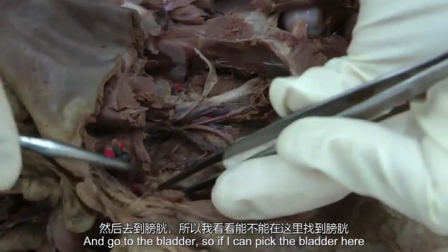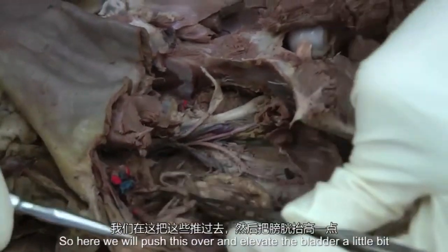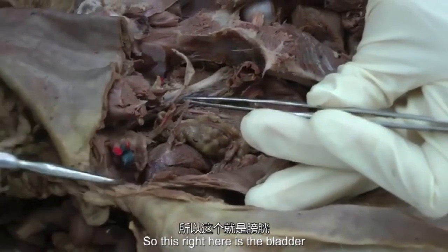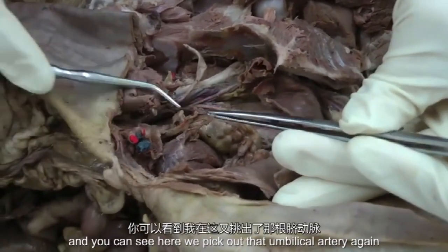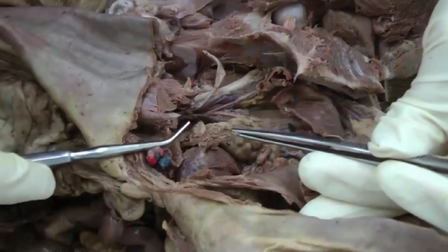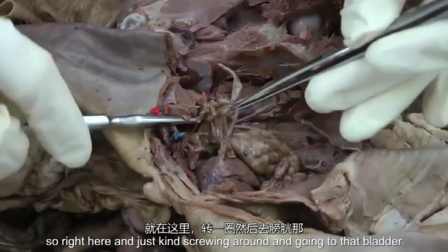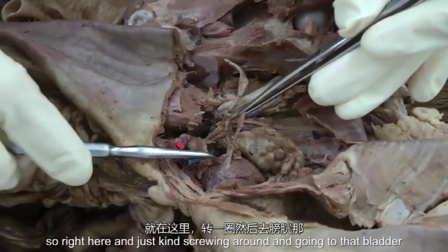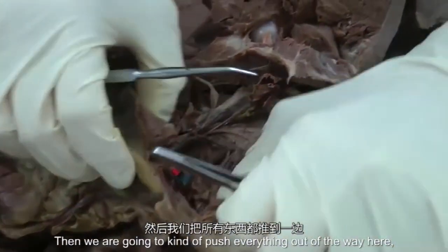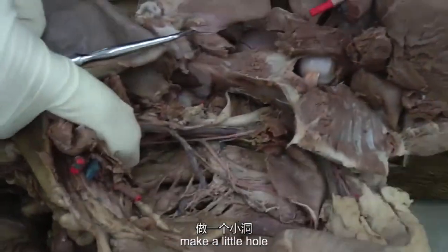So if I can pick up the bladder here, we'll push this over and elevate the bladder a little bit. This right here is the bladder, and you can see here we pick up that umbilical artery again. Looks kind of like a nerve. I can't even pick it up. There we go. So right here, just swooping around going to that bladder. That's the umbilical artery.